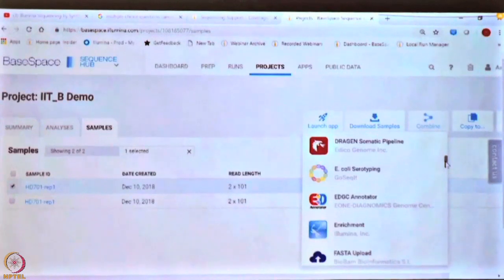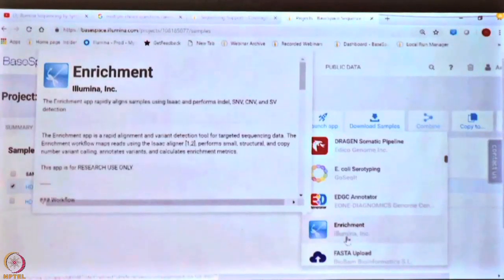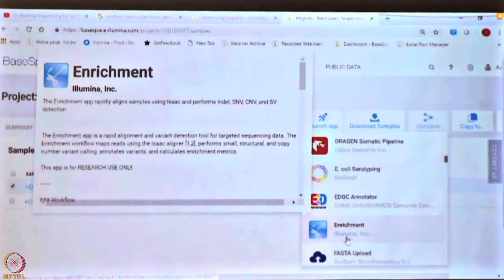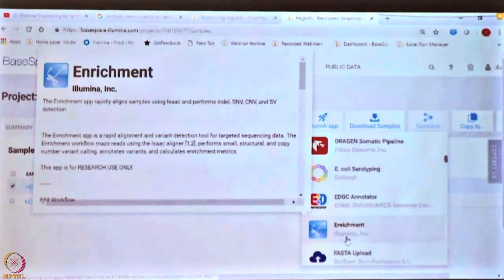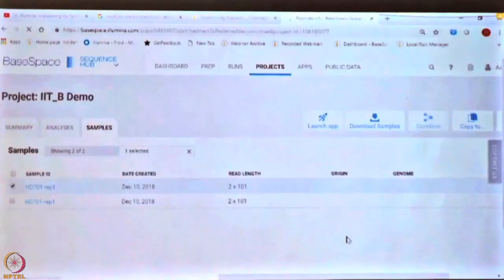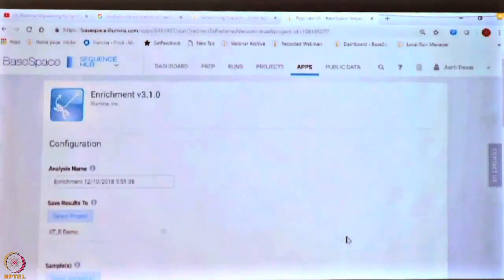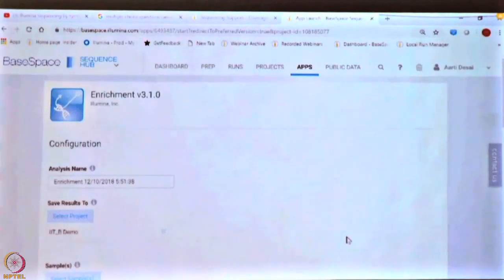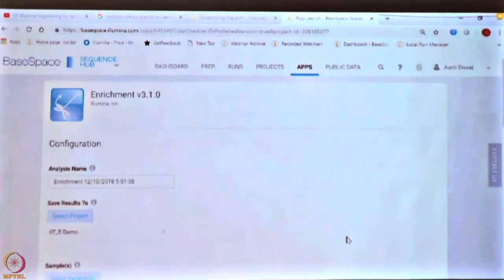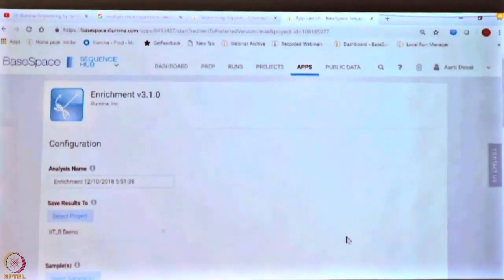Because this is a cancer panel that we have done enrichment on, I can choose an enrichment app. What this will do is run what is known as variant calling — it will call mutations and small indels. So I selected a file from my project, clicked on launch app, and from the launch app selected the enrichment app, because the data is from the TruSight Cancer panel and we want to get variant calls — mutations and small insertion deletions.